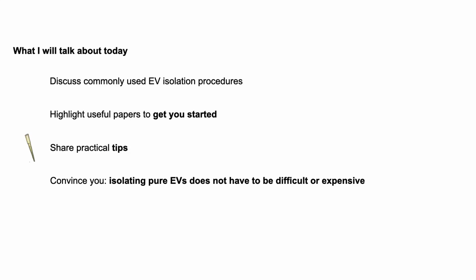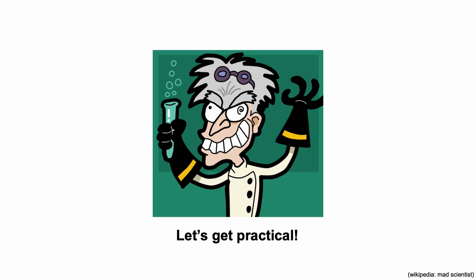So today I will briefly discuss the commonly used EV isolation procedures, and I will highlight useful papers to get you started if you're new to the field. I will share some really practical tips indicated with the pipe tip. And I would like to convince you today that isolating pure EVs does not have to be difficult or expensive, and basically everyone can do it. So now it's time to get practical.